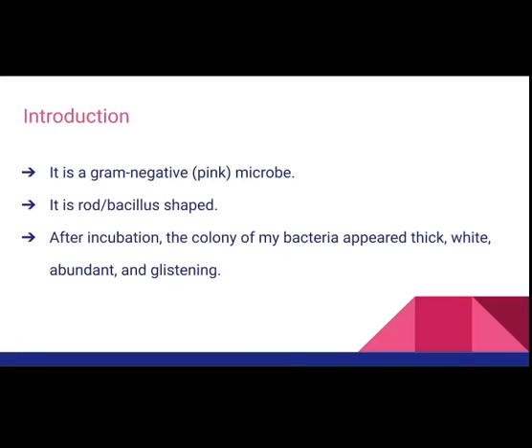So a little bit about the appearance of this microbe. It is gram-negative, and so it has a pink appearance underneath a microscope. It is a rod and bacillus-shaped microbe, and it forms a white, thick, abundant, and glistening colony.